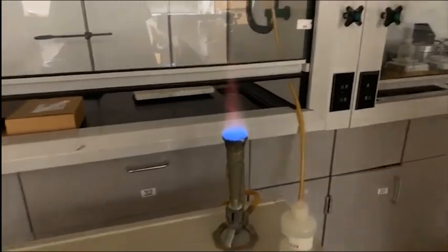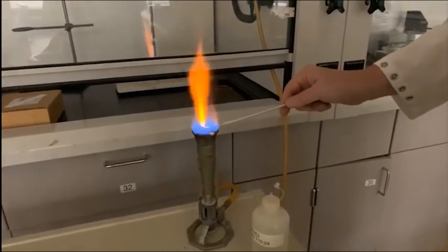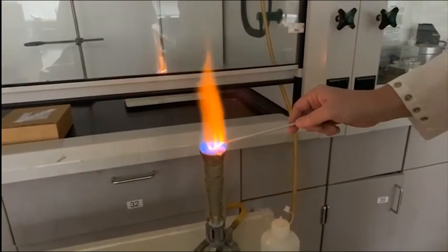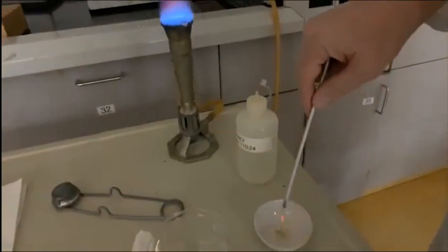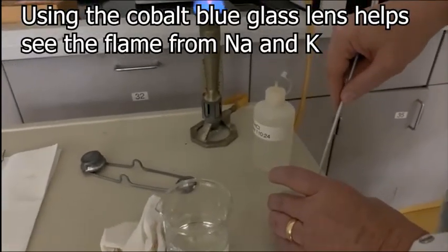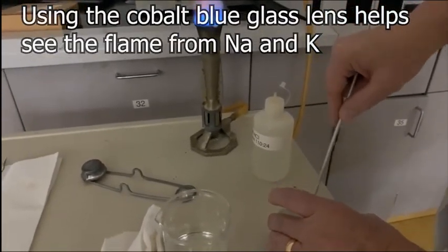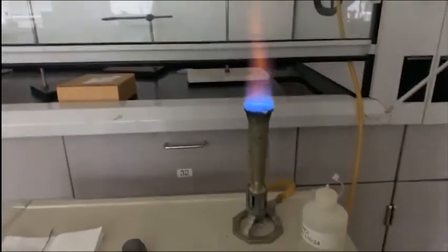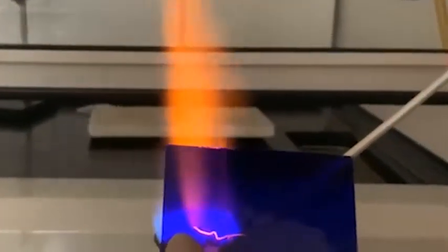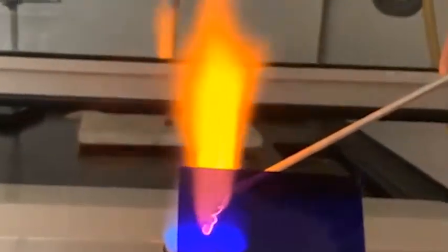Rinse off the wire, flame it one more time to clean it. And then we're going to do a flame. We're going to look at the flame through the lens. And what we're looking for is a bright, intense flash through the lens. That will be evidence of potassium. Oh, I see. You see it? Okay. And that concludes this part of the experiment.